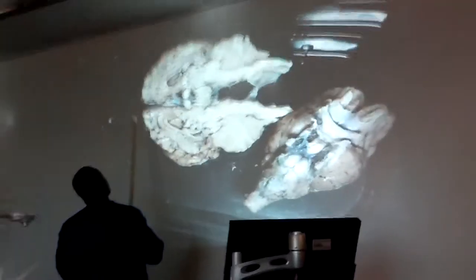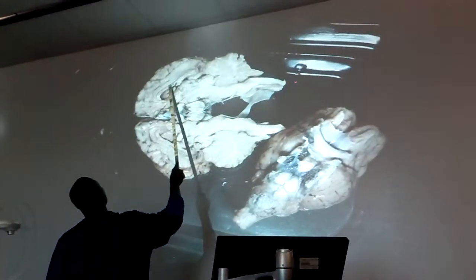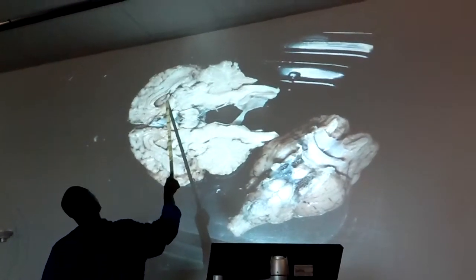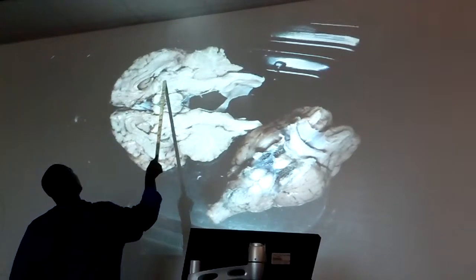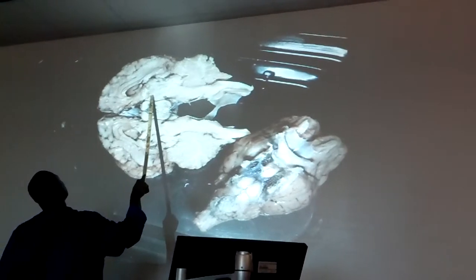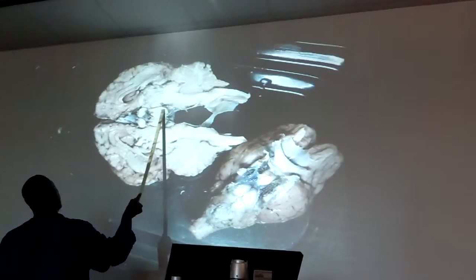Mr. Gilmore, do that again. See this cute little thing right here? Corpus callosum. You see this pitted area right here? Lateral ventricle. You see this cute little thing right here? Fornix. After the fornix, what's going to be below it? Thalamus. If this is the thalamus, that makes this hypothalamus. So that makes this the pituitary.